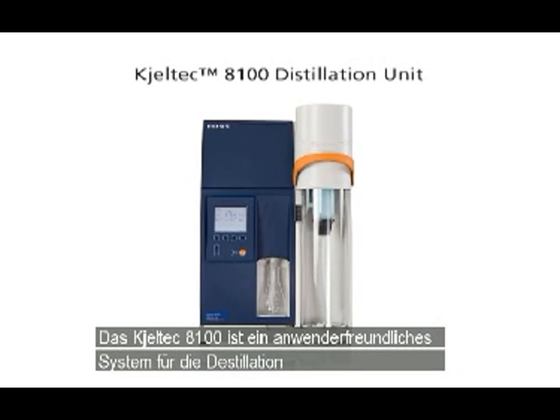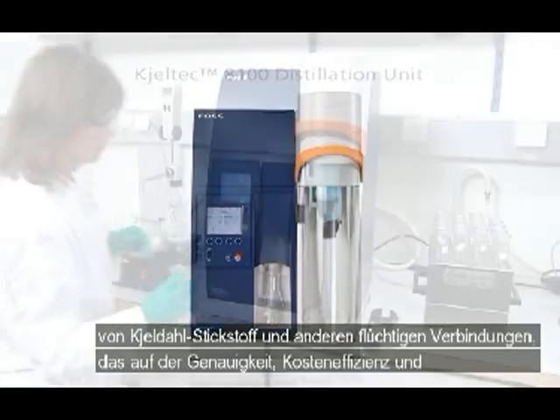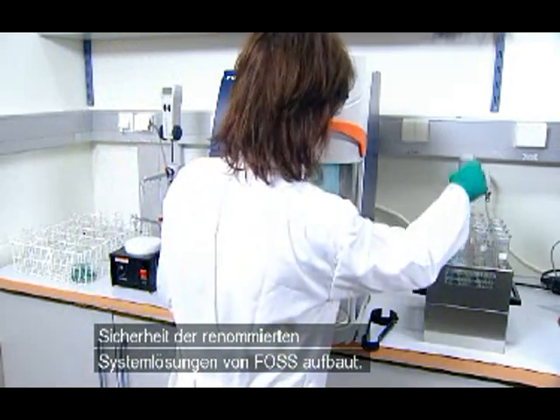The Kjeltec 8100 is an easy to operate system for the distillation of Kjeldahl nitrogen and other volatile compounds, built on the renowned accuracy, cost effectiveness and safety of FOSS analytical solutions.